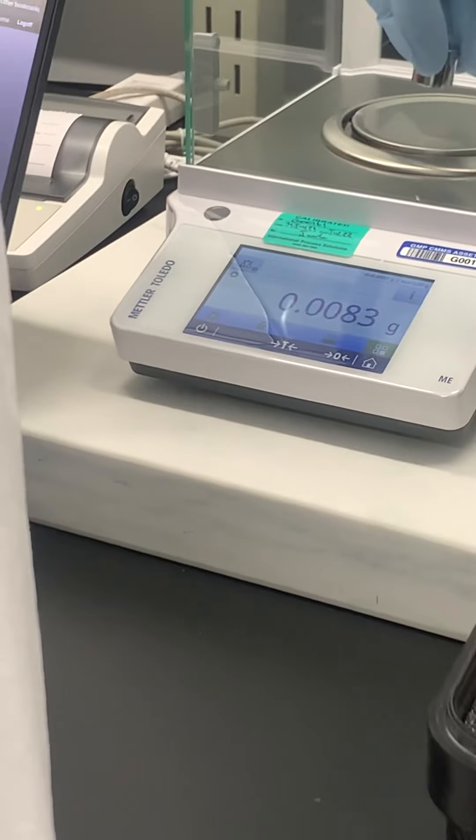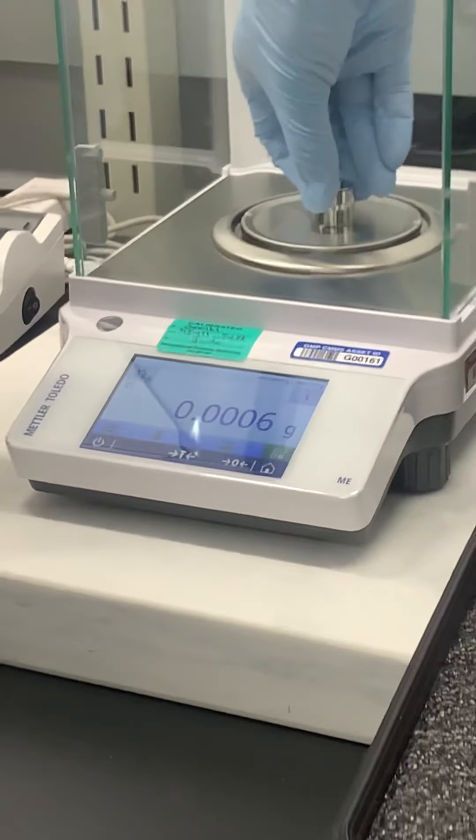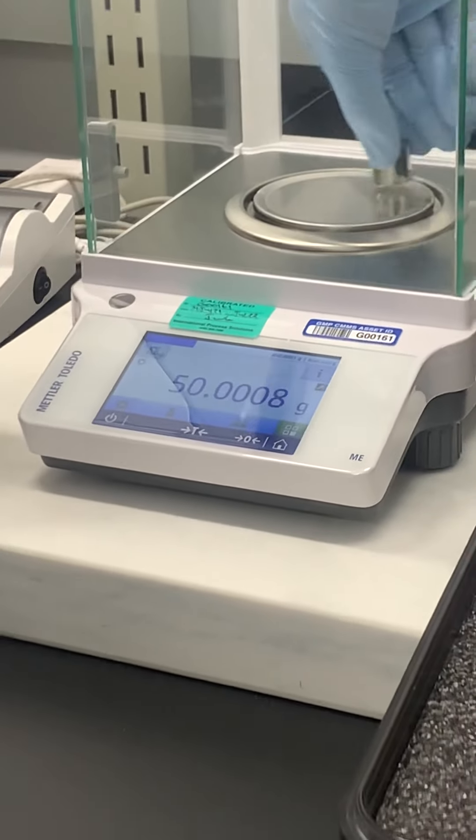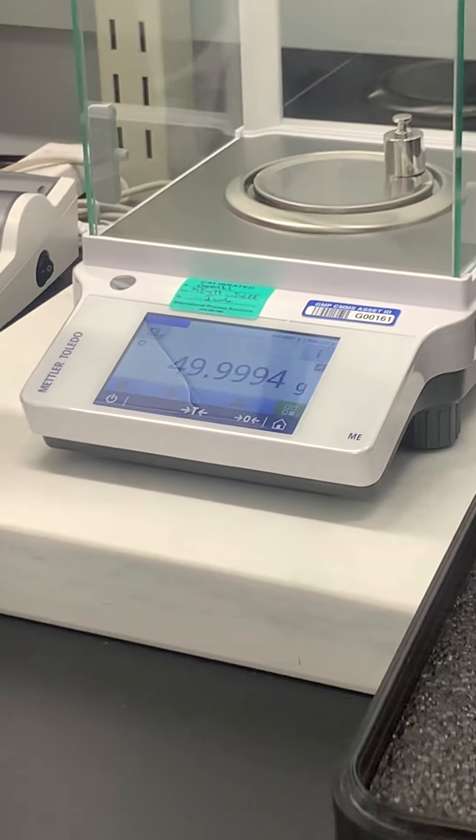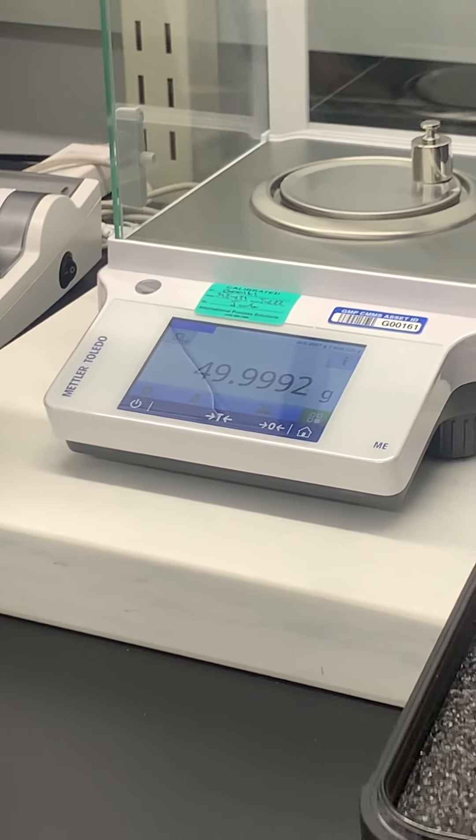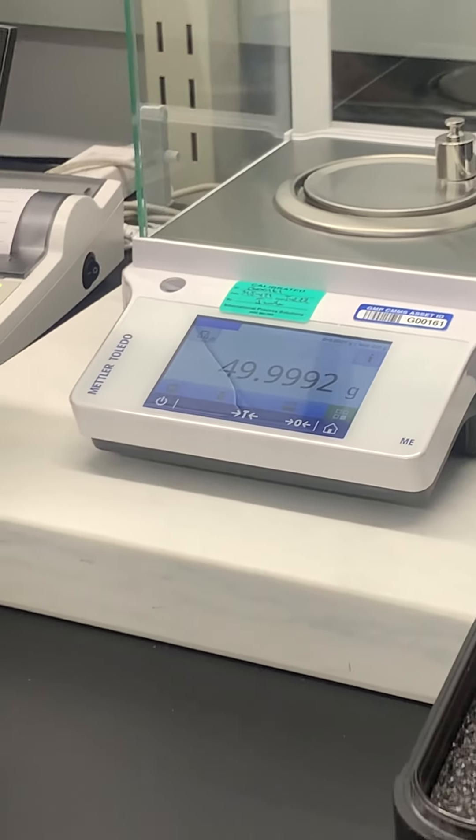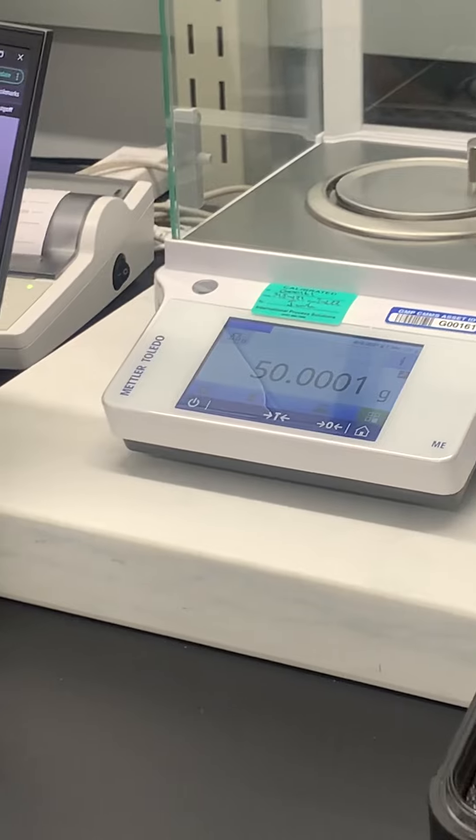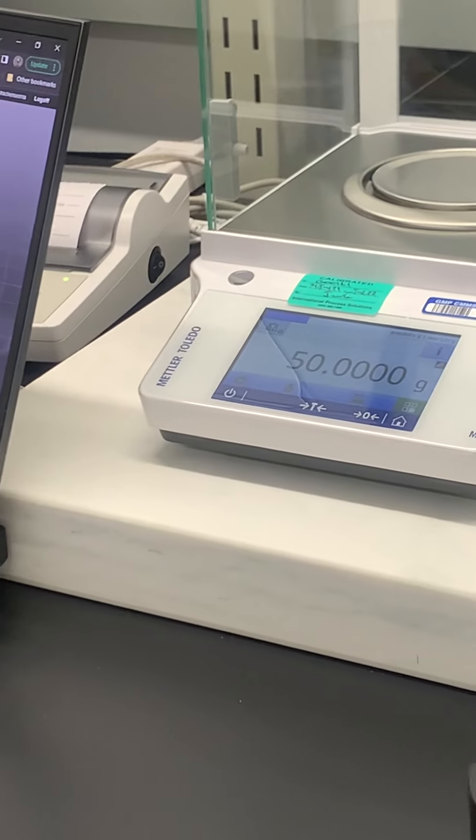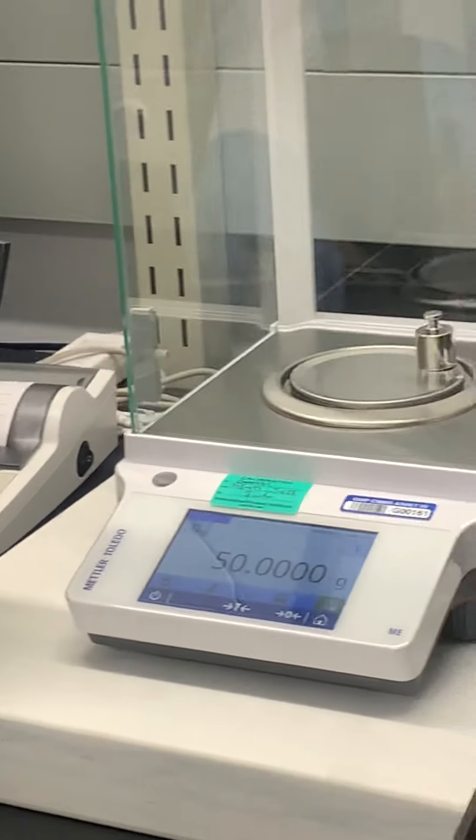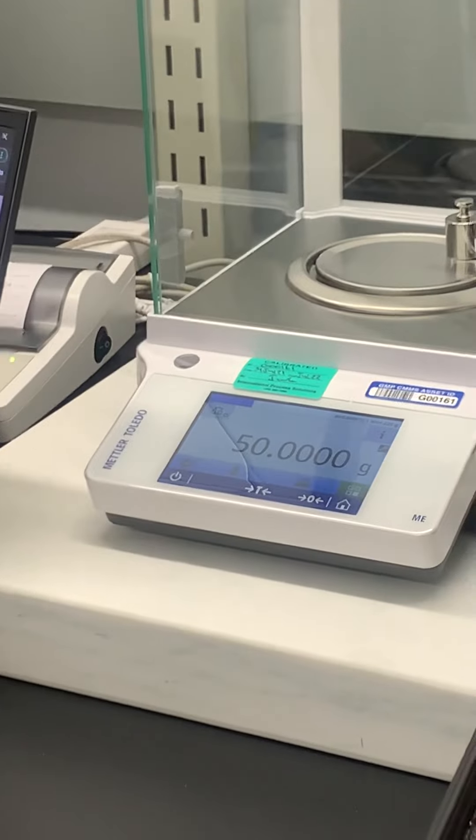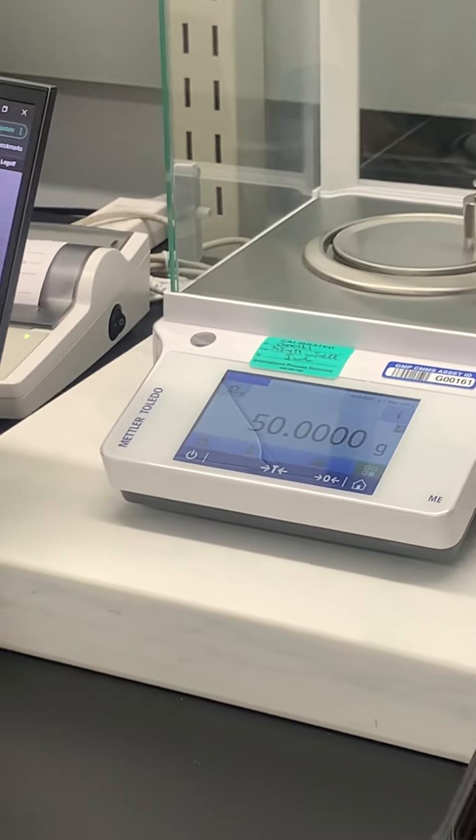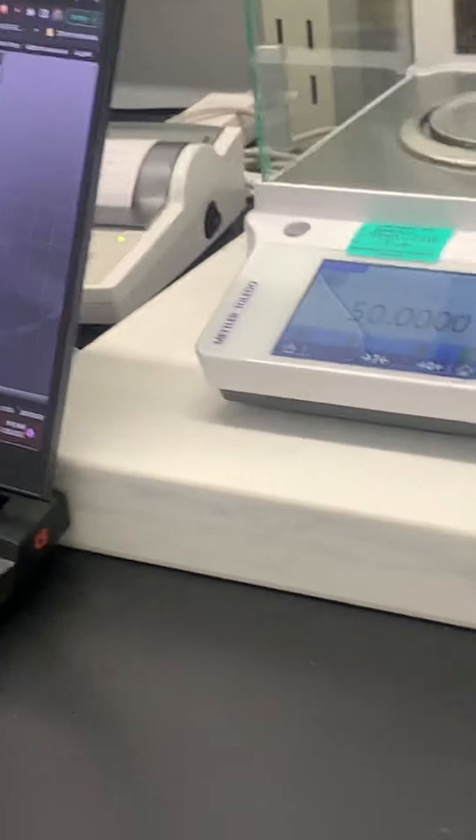You have to be careful because it won't let you know. Really? Yeah, like you know, just like some electronic error or something like that. So it'll take it as passing, it'll take it as passing and it'll be like 'this is completely correct.' Really?